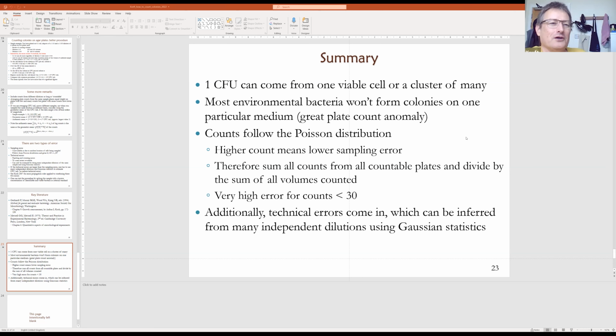coli. Growing environmental bacteria that have specific requirements or are more difficult to grow, that's something you have to learn, and not everyone can. For example, it took me 3 months to learn to grow the bacterium that I was using in my PhD. And we never had enough time in any student project for the students to learn to grow this bacterium. So I could basically not do any student projects with this bacterium. But many pathogens are easy to grow, so that problem is less of a problem.